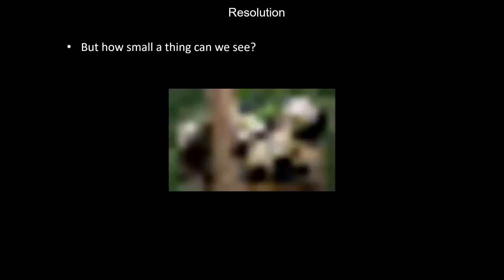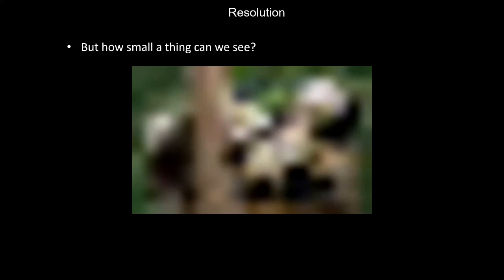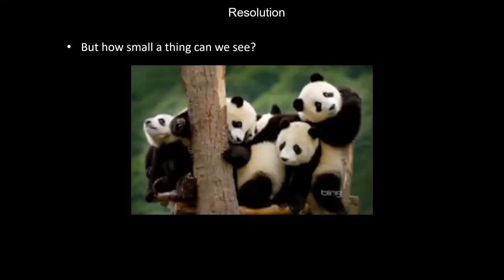Projecting a magnified image of the sample only makes sense if you can resolve the fine details of your sample on the magnified image. I mean, if you have enough lateral resolution. Otherwise, the magnified image doesn't give us any new information about the subject, and it looks just like this, a magnified blob.